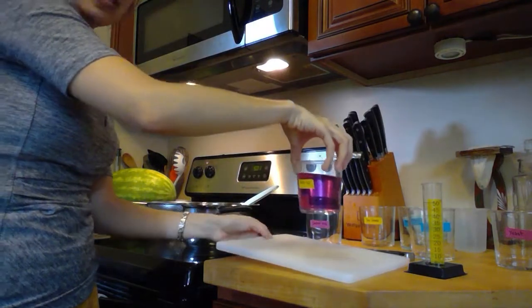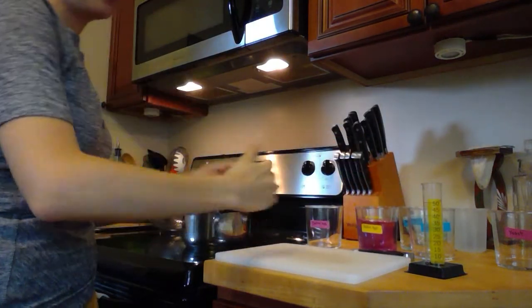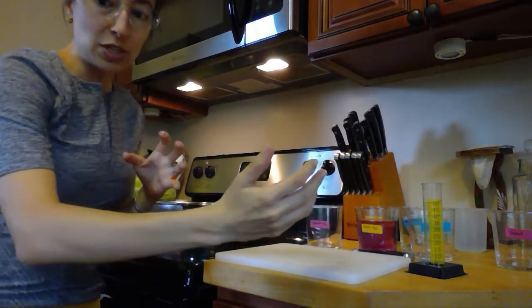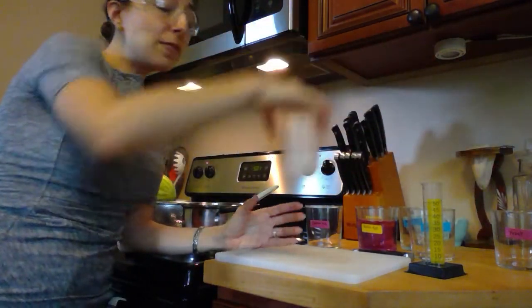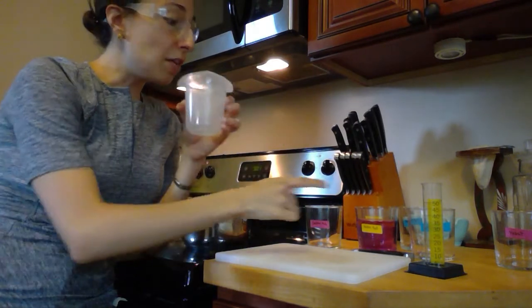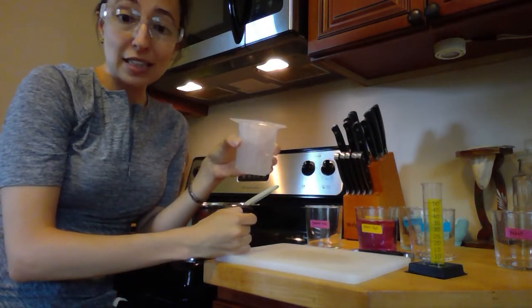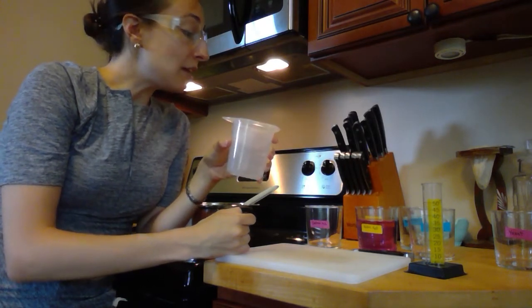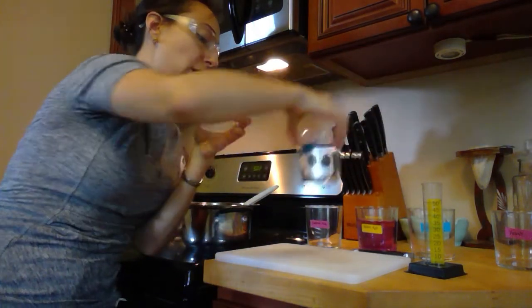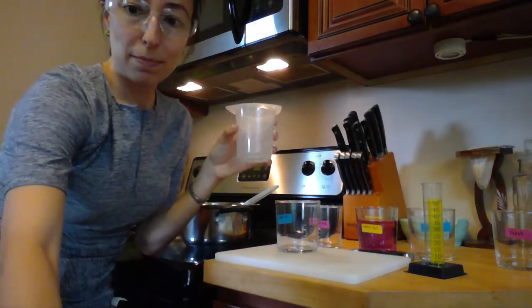Now I want to keep this cup around because, again, we want to spread them out so we can see the whole range of things that we're testing as best as we can. So I have to use the same beaker for all of my different samples, which means I'm going to be rinsing this out very thoroughly between everything that I do. So I'm going to go ahead and fill up my basic water now, and let's see what happens with that.